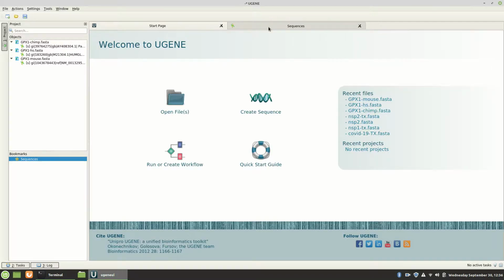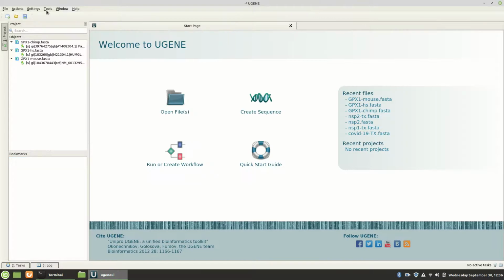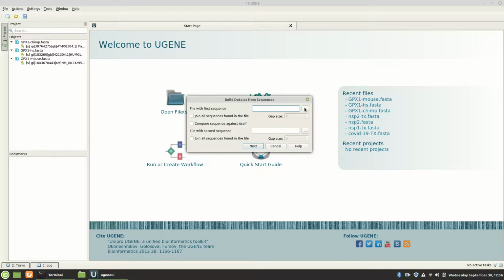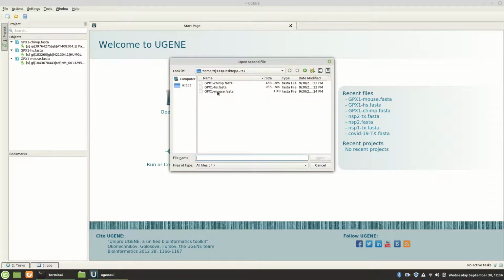Changed something I shouldn't have. Yep. Well, we'll do this again, won't hurt. So we did build dot plot, Homo sapiens, and mouse.